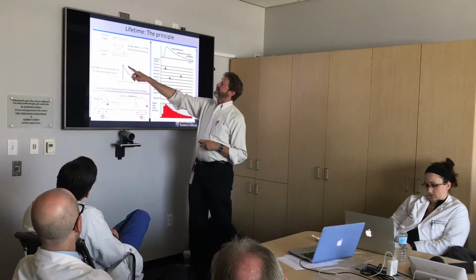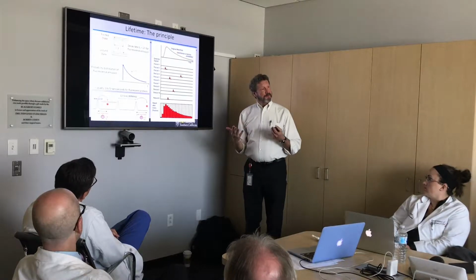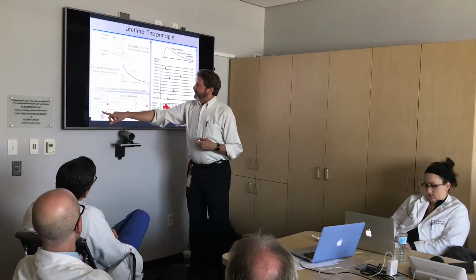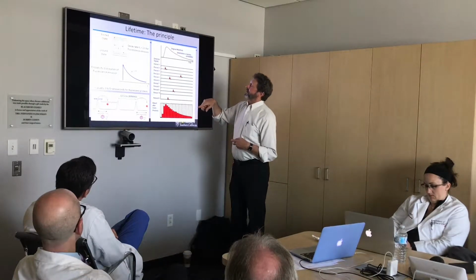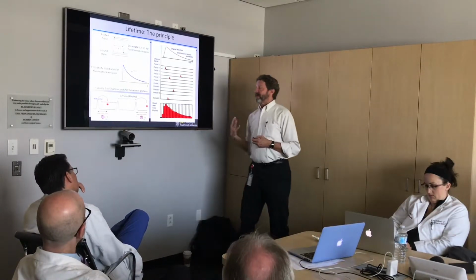So if we could measure that exponential and deduce what the lifetime is, we would be able to read the physiology of the cells. So we use a pulsed laser at 80 megahertz, so you could time the amount of time it takes each one of the photons to come out and build up that histogram. That can be done, but it's relatively slow.